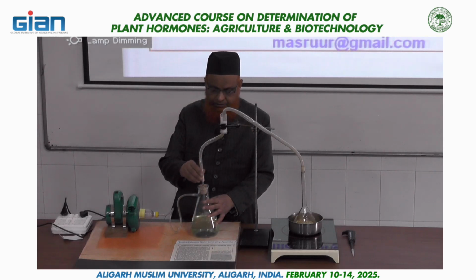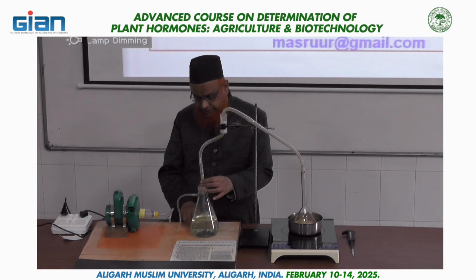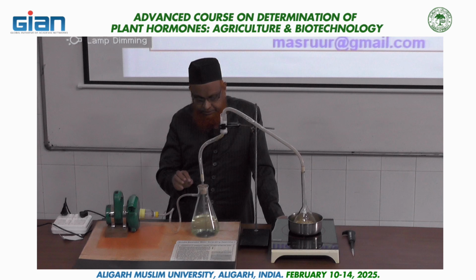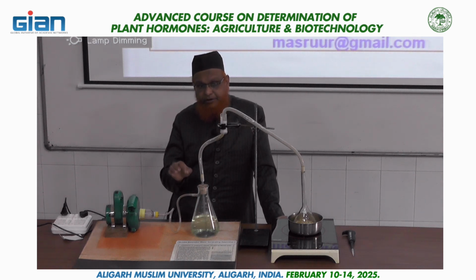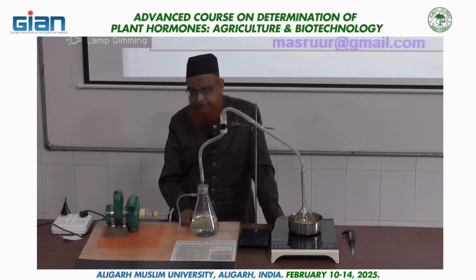So this tube was connected to a glass tube, okay? And in the glass tube, the lower end was just above the bottom. It should not touch the bottom, but rather be 0.5 centimeter or 1 centimeter above, so that the smoke can pass easily, right? Then we take the double distilled water in the suction flask, and it should be measured. We did not measure it, but you should take exactly 1 liter of double distilled water inside this suction flask, right?